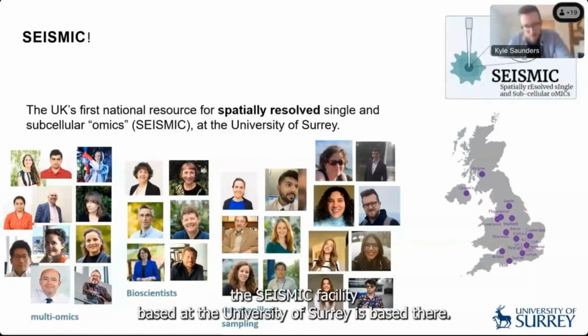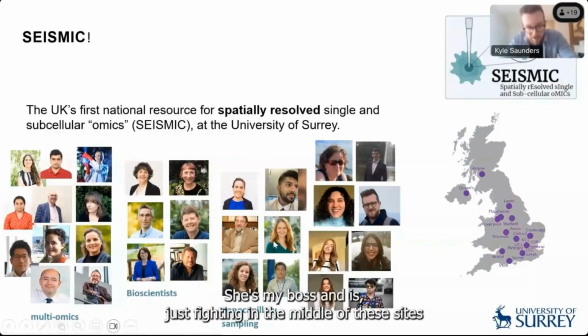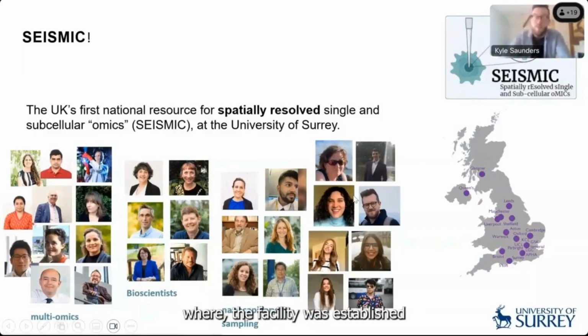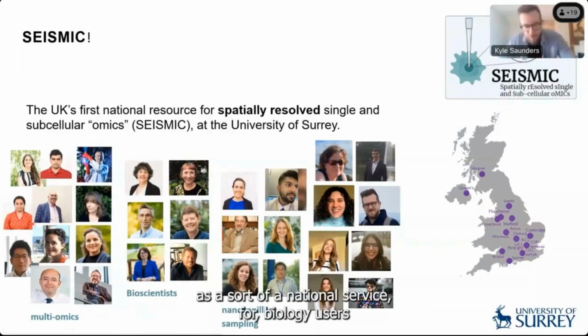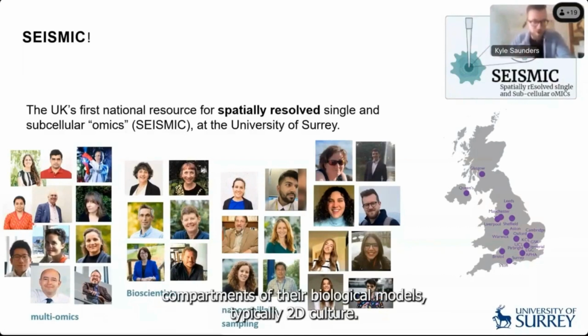But the SEISMIC facility based at the University of Surrey was established by Professor Melanie Bailey, who's my boss, and is just hiding in the middle of these photographs here. The facility was established as a sort of national service for biology users to basically use the SS2000 to isolate single cells and subcellular compartments of their biological models, typically 2D culture.